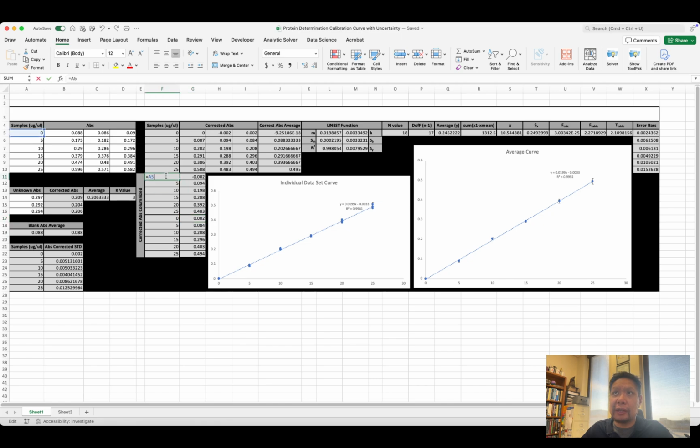So for example, again, if I click on that, it says A5, A6, A7, A8, A9, A10, and so on, right? I didn't even have to do anything for this up here because it's already in column form, but these guys over here need to be in column form. And that's why I did this, okay? Same down here, see A5, A6, right? And so one of the things you could have done was, instead of just referencing the A5 all the way through A10 over here like I did, you could have typed in these numbers by hand.